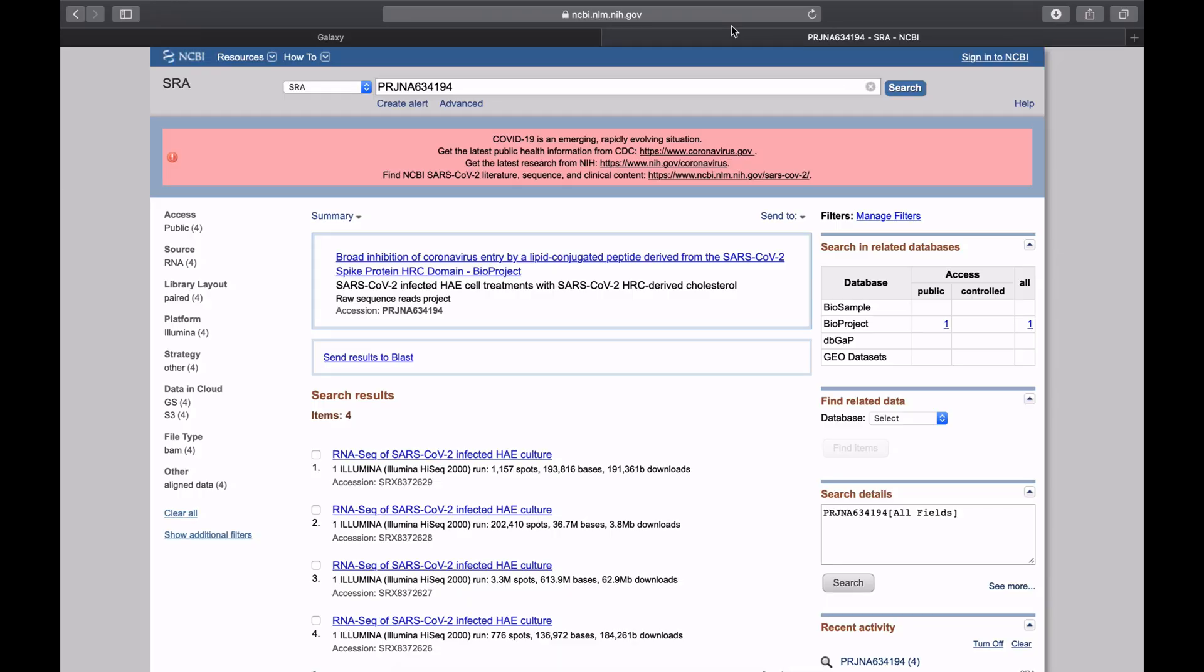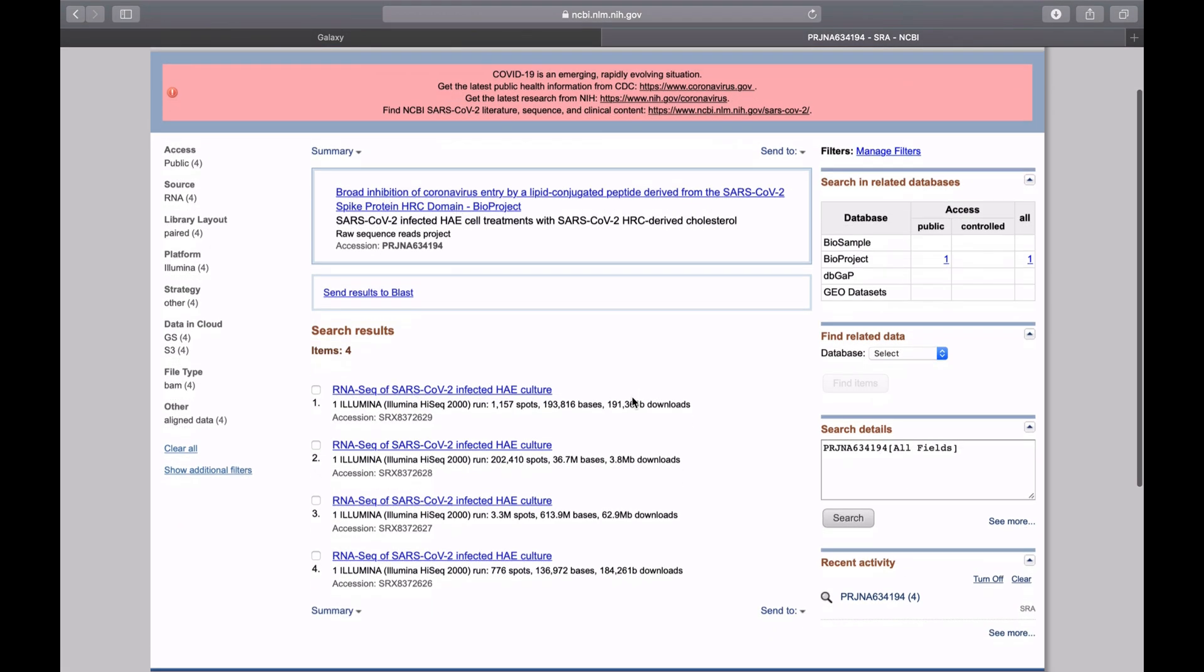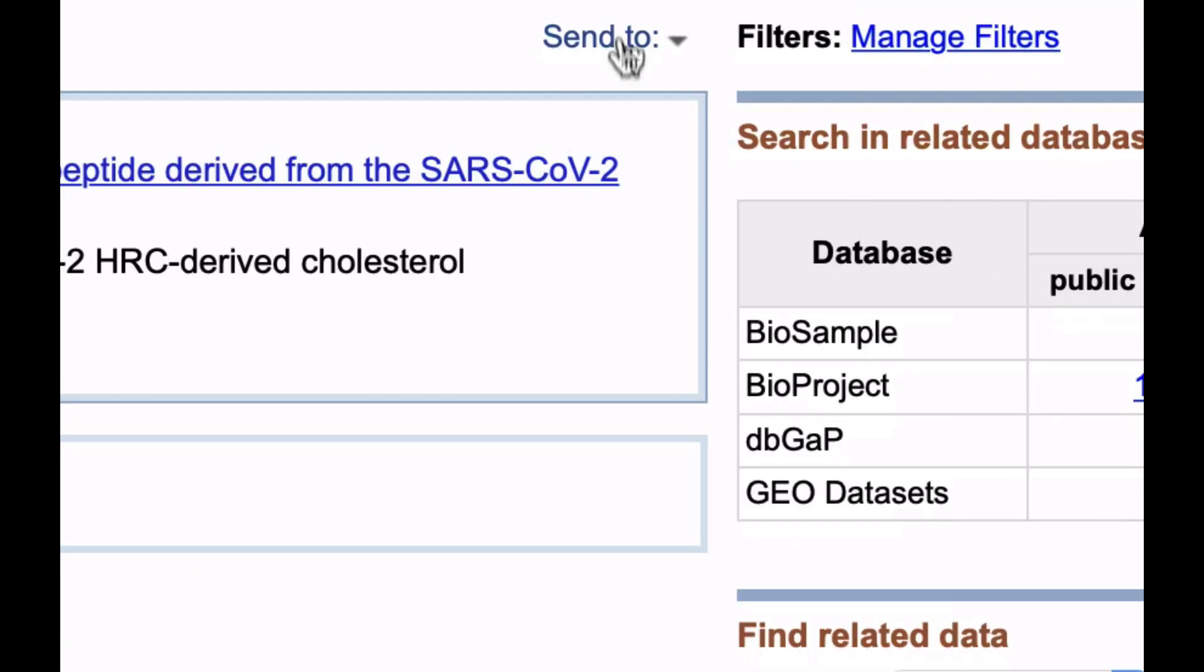You're looking around SRA and you found data you want to analyze. How do you get it into Galaxy? Well, here we have four datasets.